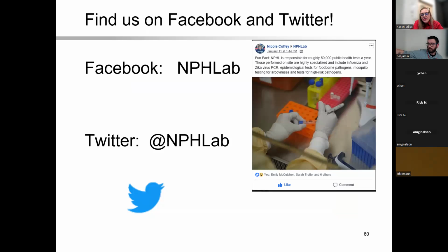I think that the quality control part of it is really important in your laboratory. I am a big believer that you should have some sort of competency system set up in your laboratory. And that doesn't mean just doing proficiency testing. Most of us do, maybe 3 times a year, have CAP or API provide proficiency testing. But what I'm talking about is competency, where you set up your own training and your own testing of your employees.